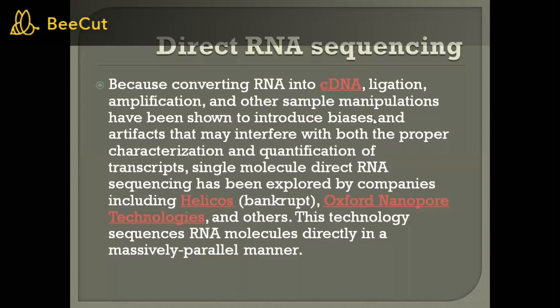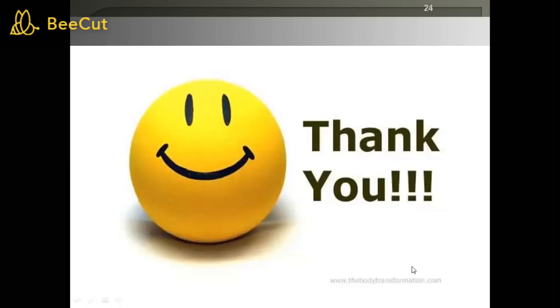For this, we have already studied the Oxford Nanopore technology. Different techniques are available. Different companies provide different machines, and by using those machines, we can directly get the sequence of that RNA molecule. So this is about the RNA-seq technique.